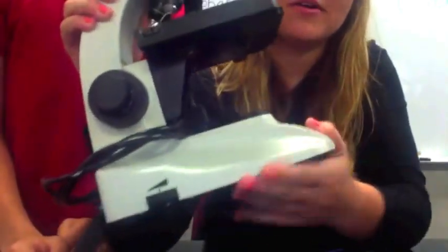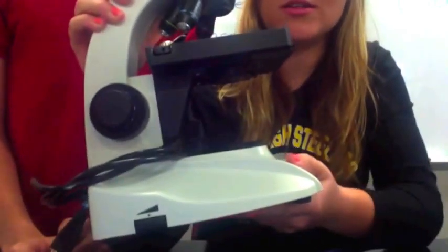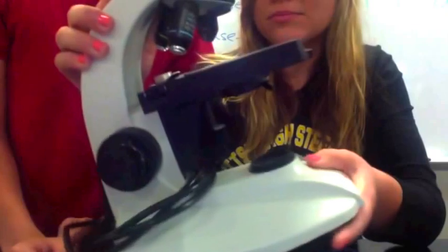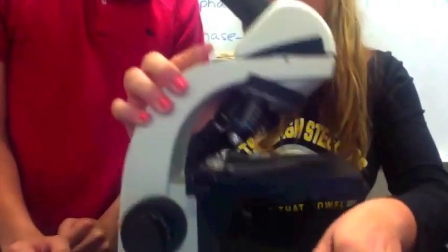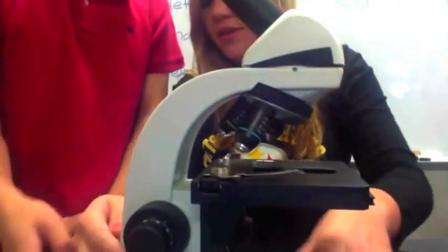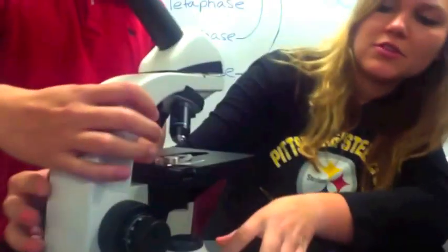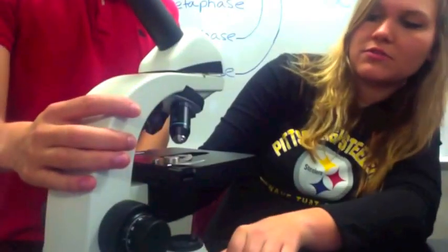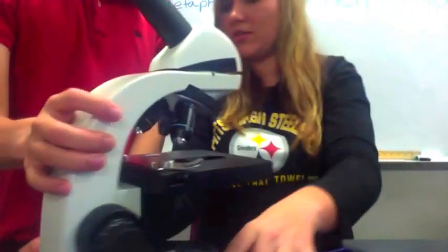This part of the microscope is called the base of your microscope.